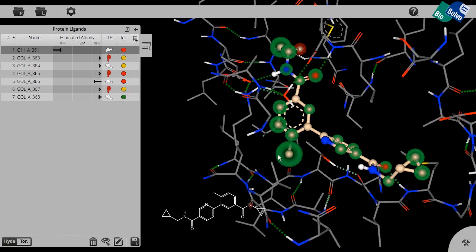We see the ligand, the ligand's atoms are surrounded by these green spheres, whose size scales directly to the contribution of each atom to the binding affinity. And it becomes immediately apparent that this methyl group here actually is the atom with the largest contribution. And this is indeed the magical methyl here. We can put this in numerical perspective by clicking on the atom.